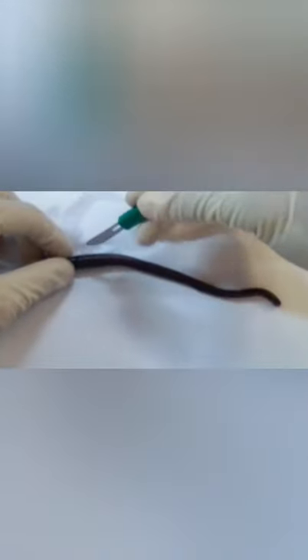So now let's start dissecting it in its posterior aspect. You must cut it very shallow.